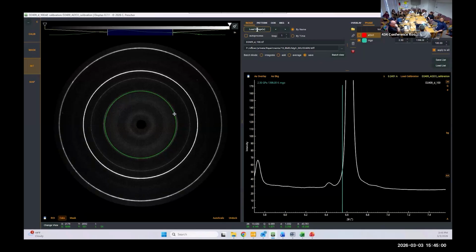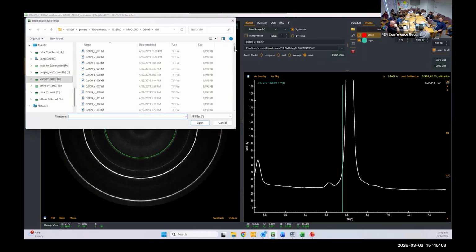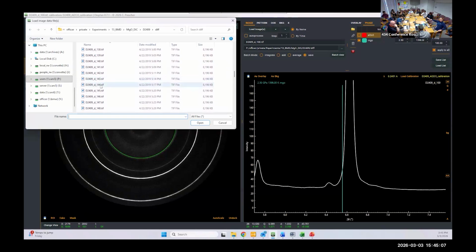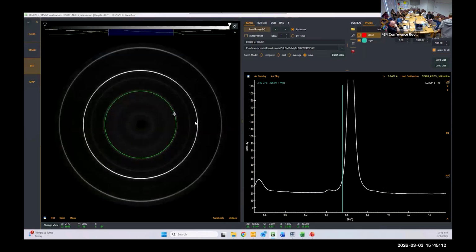So now what we want to do, we've talked about this many times so far, is we have our diffraction ring. Say we had a circle when we weren't under stress, or we could be under hydrostatic stress, and we'll get a circle. It means all the grains are compressed the same amount.